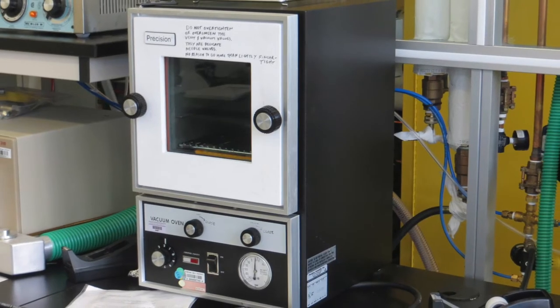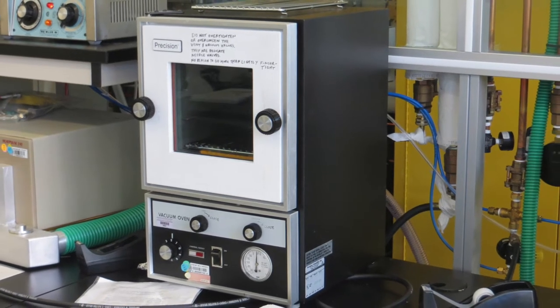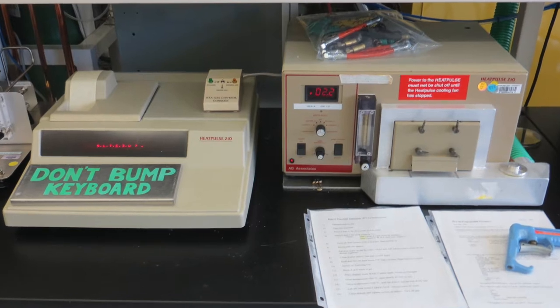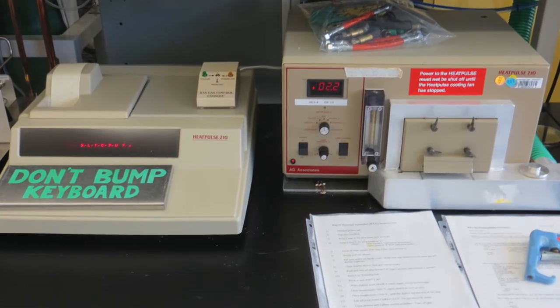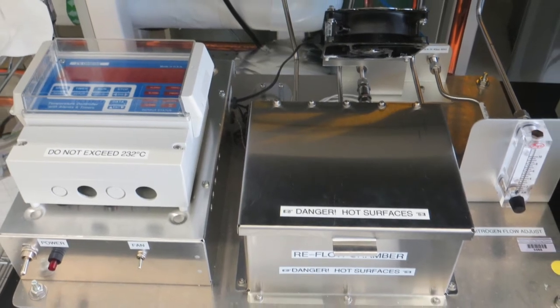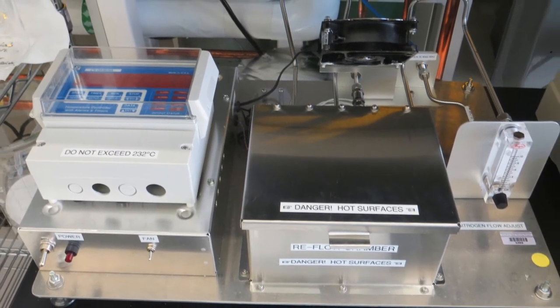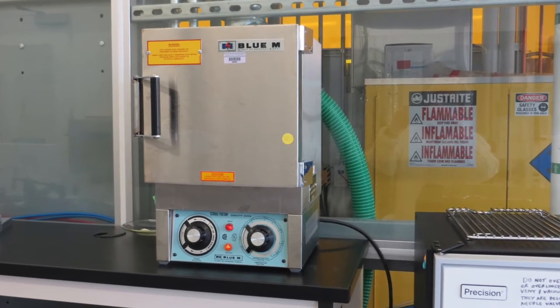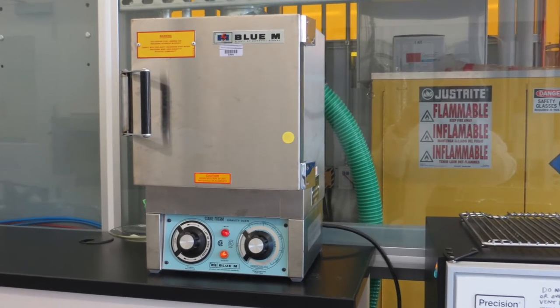Next to that is a vacuum oven which we mainly use for degassing epoxies and PDMS. This is the rapid thermal annealer used for annealing ohmic contacts. And this is the reflow chamber to solder stacked chips after flip chip bonding. We have many of these Blue-M convection ovens in various locations throughout the lab.